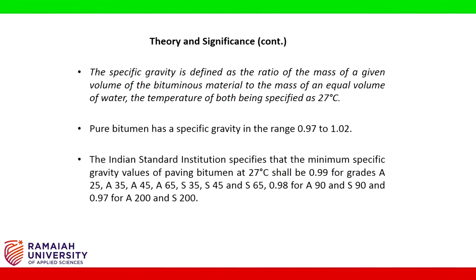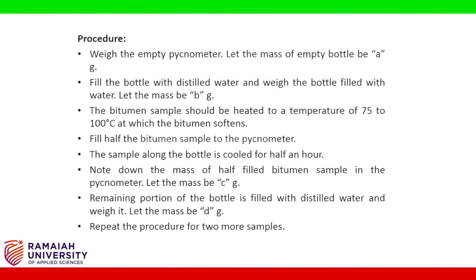Procedure: weigh the empty pycnometer. Let the mass of empty bottle be A grams. Fill the bottle with distilled water and weigh the bottle filled with water. Let the mass be B grams.